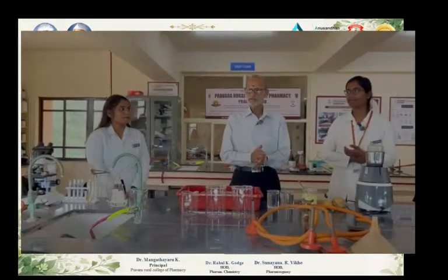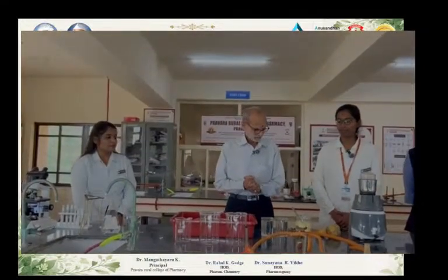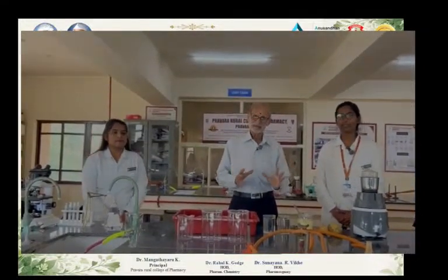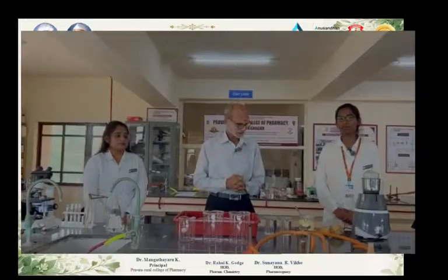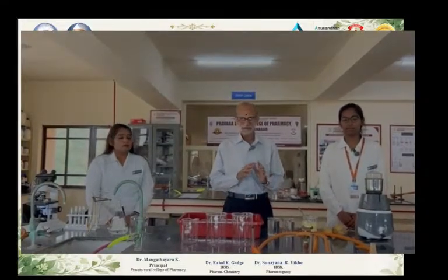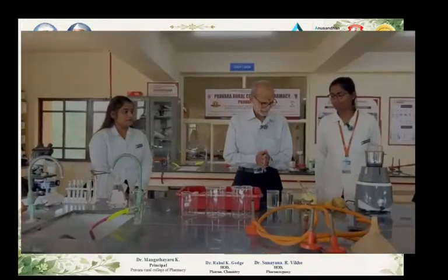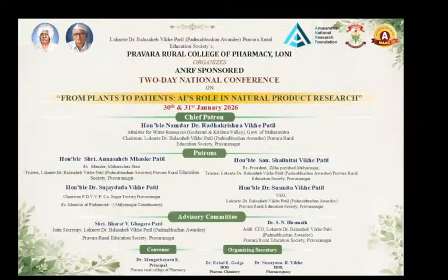We are going to begin with the very first experiment, that is separation of starch from potato. Let me give some idea about the starch. Starch is extensively used in industry, whether it is food industry, pharmaceutical industry, or textile industry, or the paper industry.